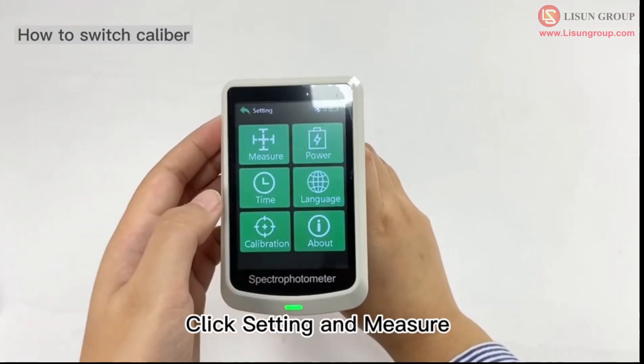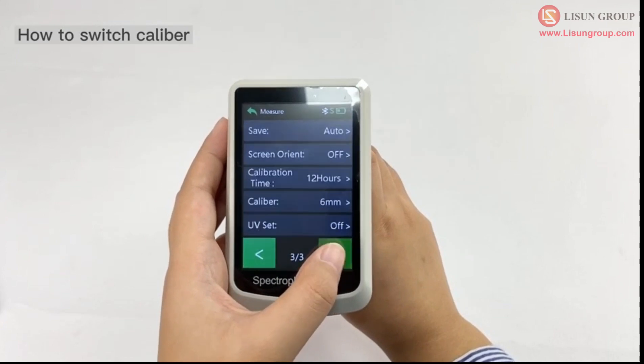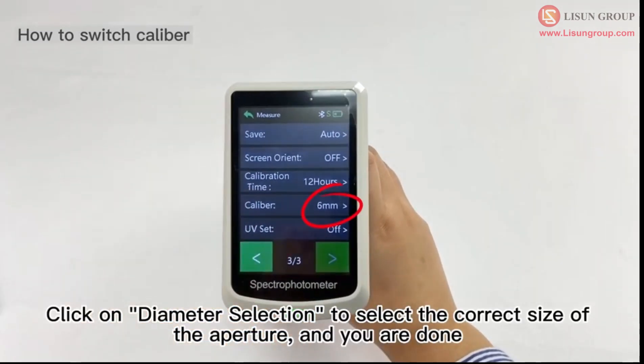Click setting and measure, then click on diameter selection to select the correct size of the aperture, and you are done.